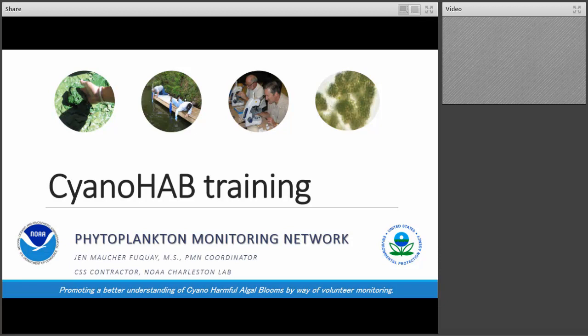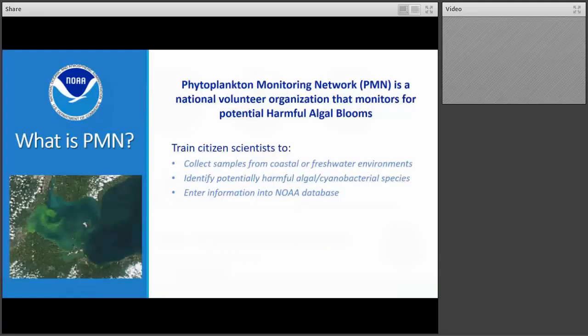So what our program is about, we are a national volunteer organization that monitors for potential harmful algal blooms. And what we do is we train citizen scientists, no matter what their scientific background may be, on how to collect samples from either a coastal environment or, in this case, freshwater environments. We're going to learn how to identify those organisms that could be potentially harmful. And you will then enter what you find in your water sample into our database.